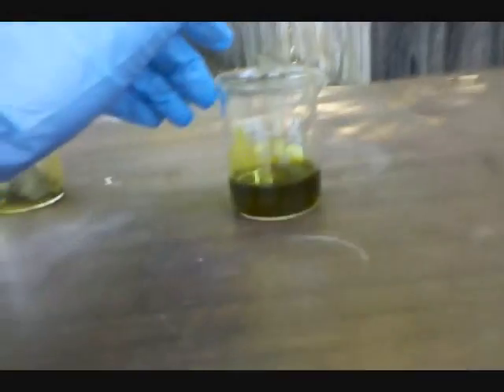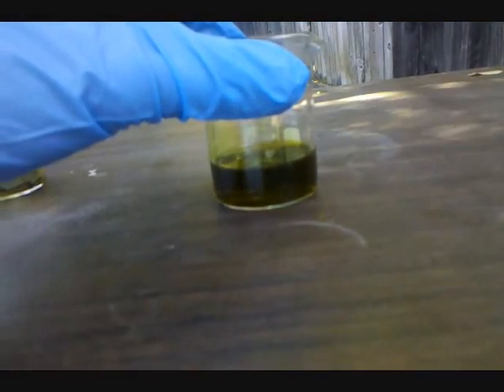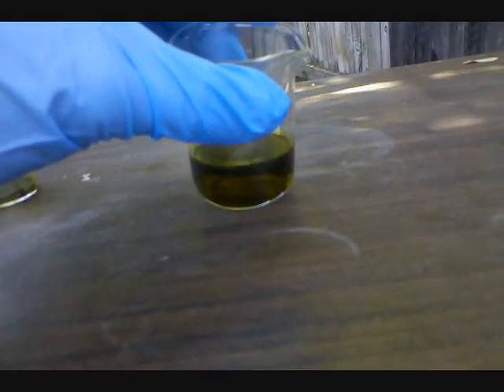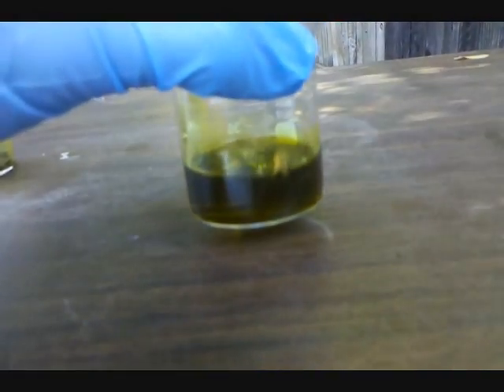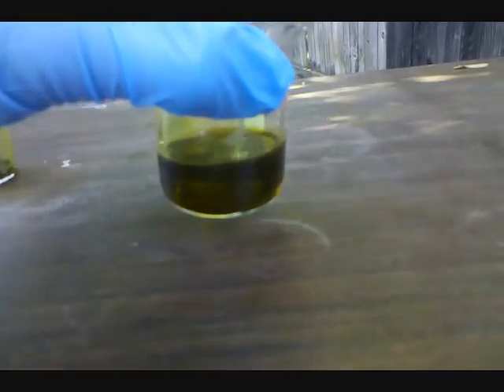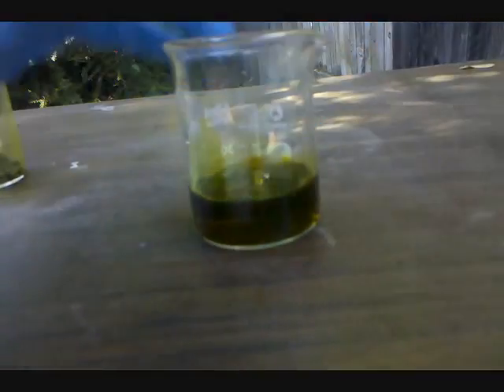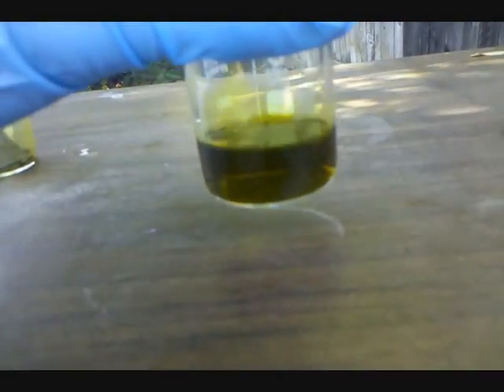I couldn't find much information online on how to go from chloro-auric acid to gold, so I developed this part myself. What I did is add a few pieces of magnesium. I'm not exactly sure what the reaction is, but it displaces the gold — the magnesium goes into the solution and you precipitate out a fine gold powder. I'll add the magnesium and show you what the reaction looks like.